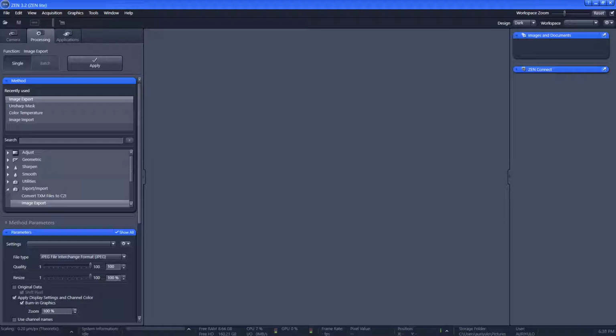And if all you want to do is get a standard shareable JPEG, then it might be worthwhile to just save JPEG straight away. This is a good workflow for diagnostic and routine labs. So I'll show you how to get standard JPEGs, and I'll also show you how to rename files with descriptive file names before saving them into the final format.